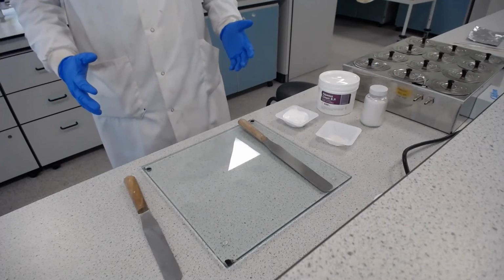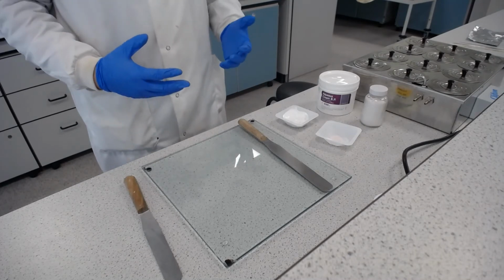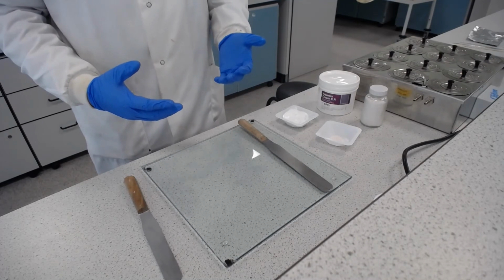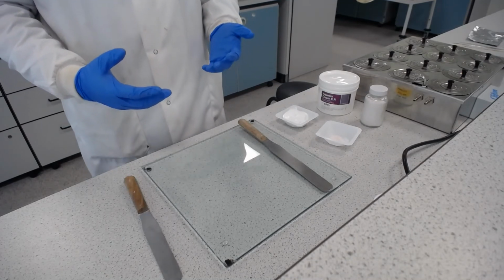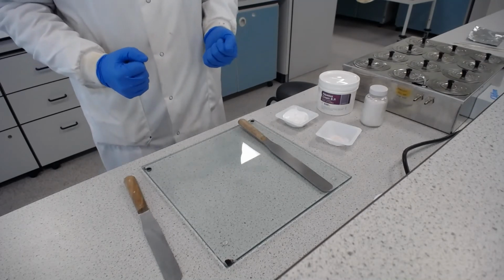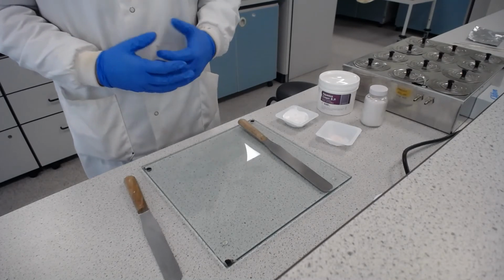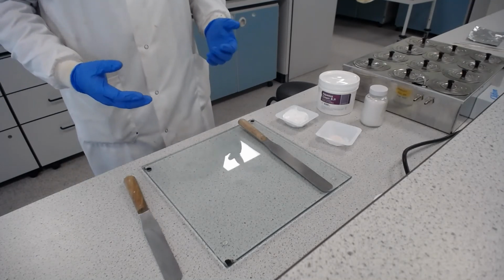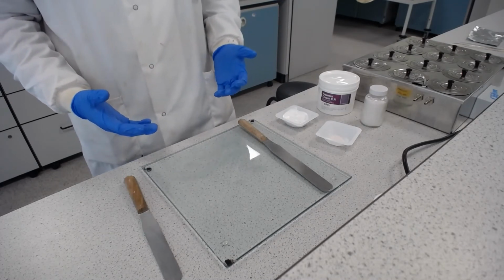The cream we have just made was produced by using a fusion method, where we heated up bases, melted them, mixed them together, and put the dry ingredients in there as well. I've already explained at the very beginning that trituration, one of the other methods, is essentially by grinding dry ingredients together in a pestle and mortar, and is something that you should already be comfortable with. But the last method, levigation, is something that you may well not have done before. So I thought I'd take this opportunity on the recording, at least, to show you what we mean by levigation.